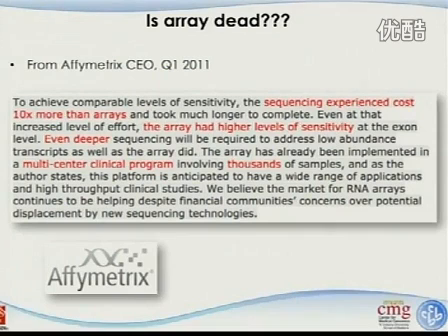And also, in terms of clinical application, if we already identify the markers, we don't really need to do the RNA sequencing to do this type of global profiling of everything. We can only design the best markers on the array and run through the chip. And I think the RNA sequencing development really pushed the Affymetrix more towards the clinical markets, which is probably a good thing for them. Okay. The conclusion here is array is not dead. They still have their specific application.